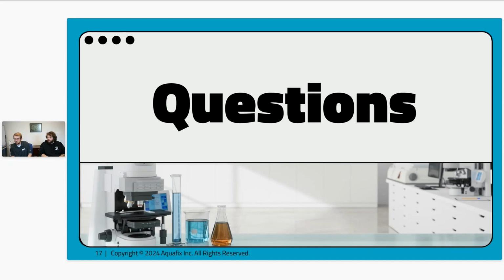We have 4 basins in the system. If we want to send samples in, how do we pick which ones to send you? That's a great question. The lab kit comes with 2 sample bottles. If we needed to send in more, we do have extra bottles to send out with the lab kit so we can look at all 4. And then it's really going to be dependent on how the system runs. If all 4 basins are run in sequence or run separately, the lab will want to take a look differently. Do you have any thoughts on that?